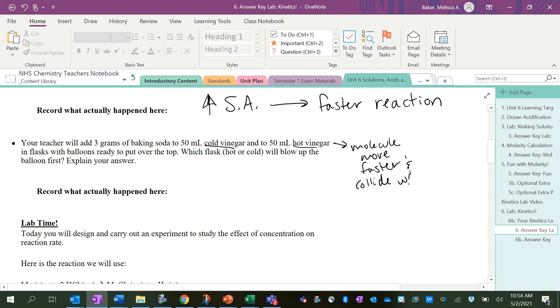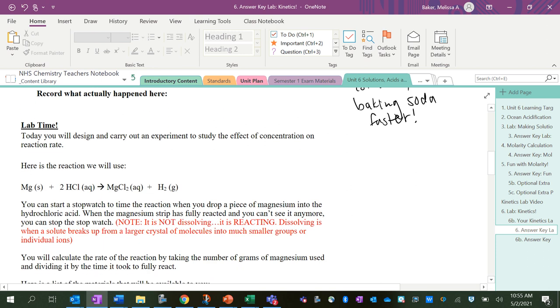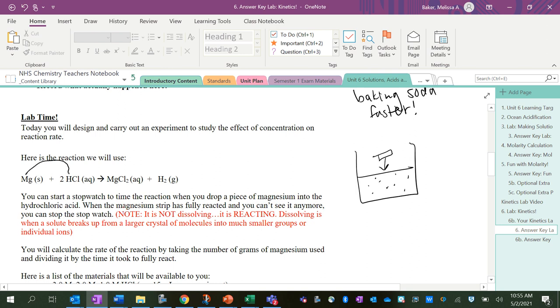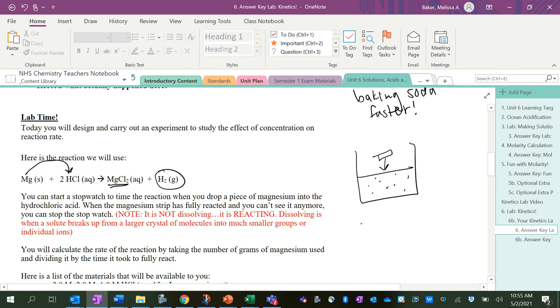But today what we're doing in the lab is studying how concentration affects the reaction rate. So we added a little strip of magnesium, silver shiny metal, to some hydrochloric acid. What happens is magnesium actually kicks out hydrogen and is with the chlorine, and it makes hydrogen gas. So there is a rearrangement of atoms—this is definitely a reaction.